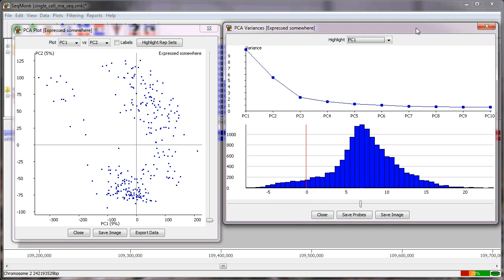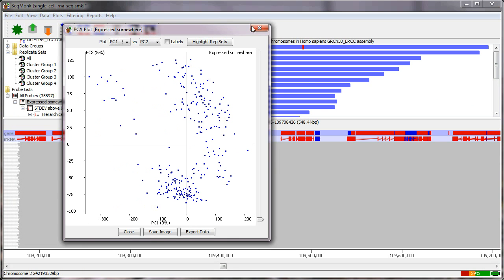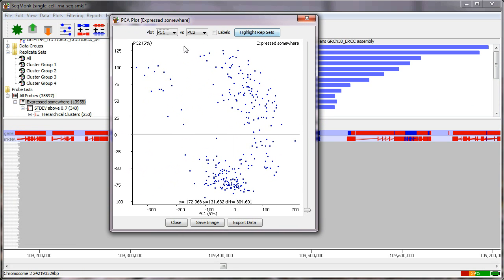We've shown in a different video where we look specifically at PCA how we can actually use the rotation values associated with principal components to start separating genes out, and that would be another way to get at a set of interesting genes, but we're not going to follow that up for the moment. What we are going to focus on is the actual PCA plot.